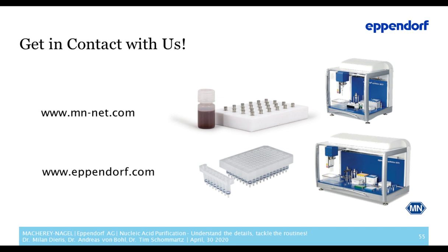Milan, let's go with you on this question. How can you protect RNA? Yeah, that's a good question. I think this came up because I mentioned that RNA is much less stable than DNA, and that it is often a problem in workflows involving RNA that degradation is happening. There are two options to protect RNA right from the start when you still have your sample. The best option is to purify your RNA as soon as possible from the sample. You don't let the sample sit anywhere for a long time, but directly add your lysis buffer and start the purification process.